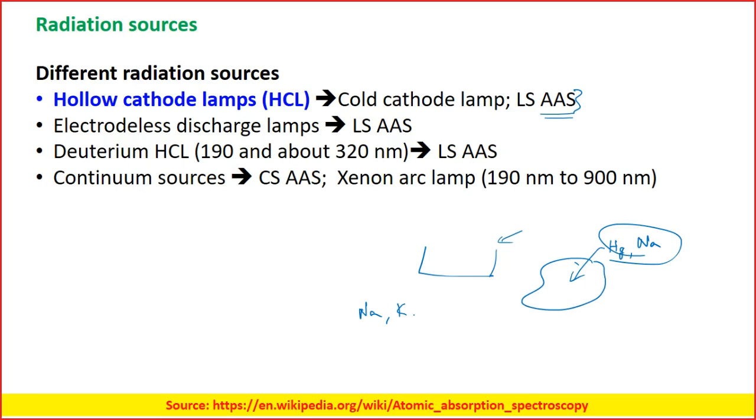They prepare a sample and say, I will do this, I will do that, blindly jumping into different analytical techniques. What I suggest is that you understand what you want to analyze. You may not need AAS or AES, so why go for those?